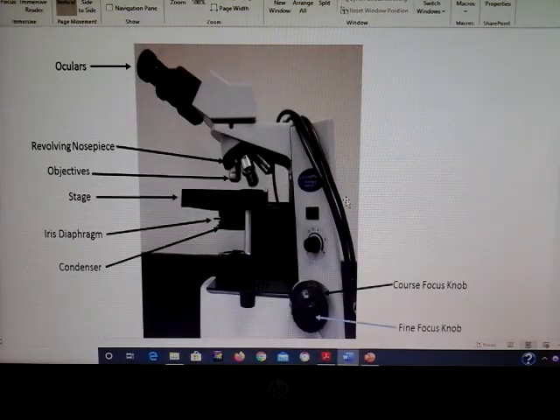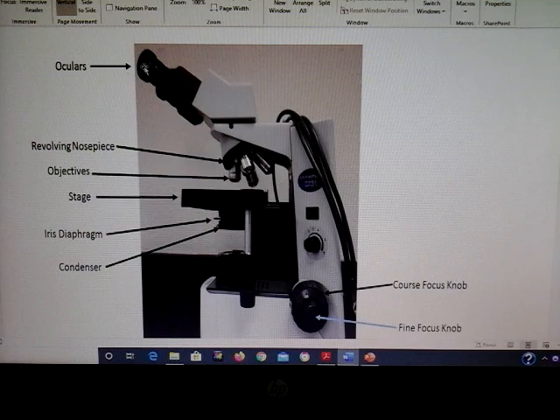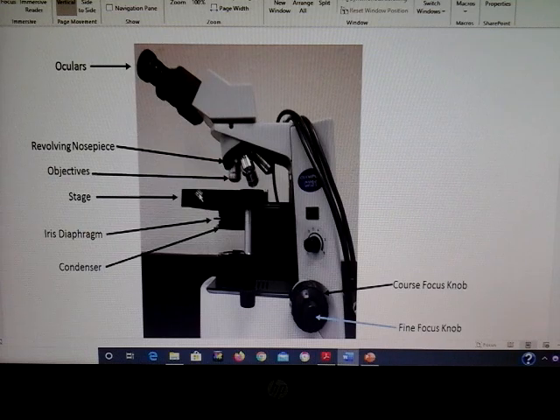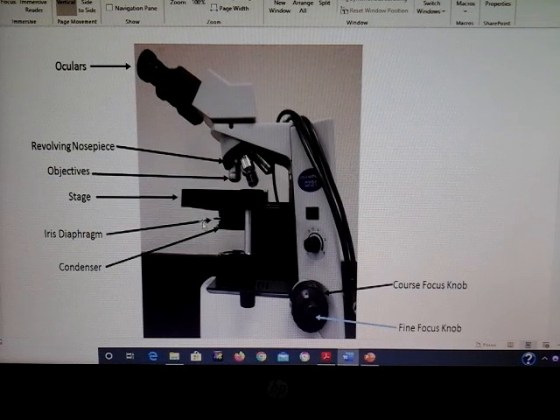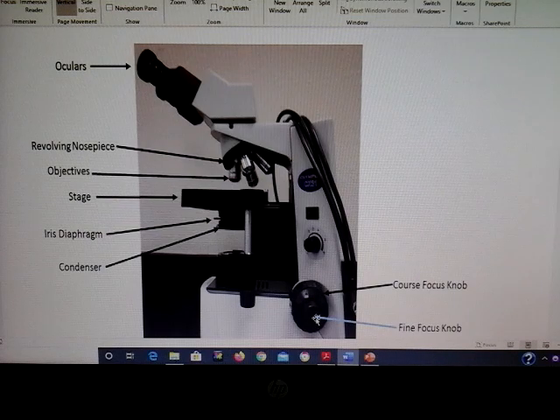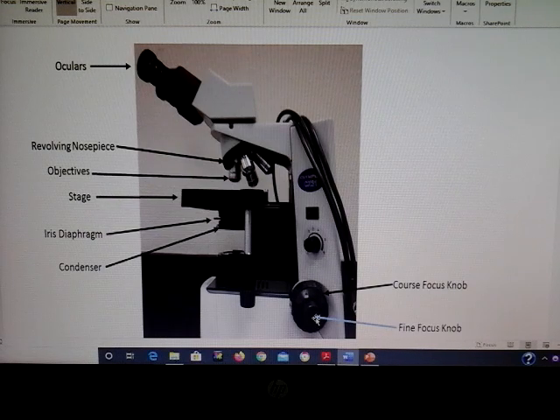Please know the different parts of the microscope. Starting at the top: the ocular lens, then the revolving nosepiece, objective lenses, the stage, iris diaphragm, condenser — the whole lens — and then the coarse adjustment knob and fine focus knob.